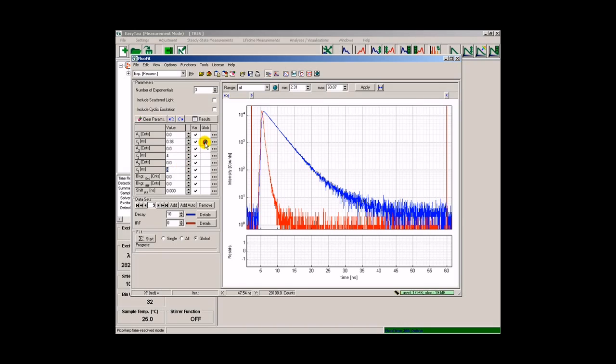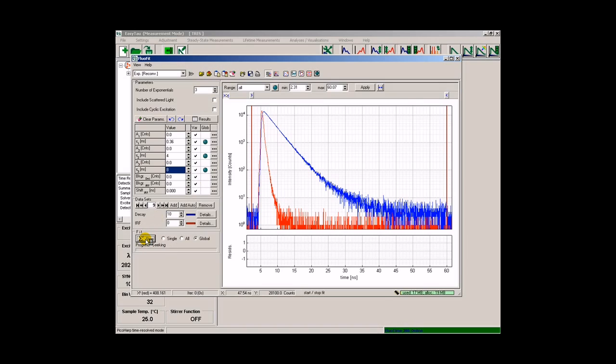I also select these three components to be global fitting parameters. This means that these three fluorescence lifetimes shall be present in every single one of the 33 acquired decays. We will leave the rest of the parameters to float freely and individually. Pressing the start button starts the global fitting procedure.